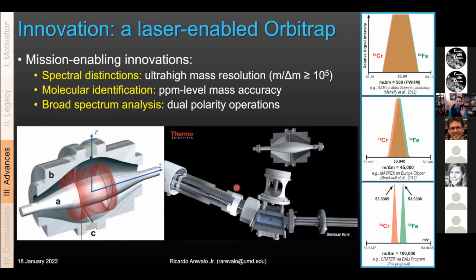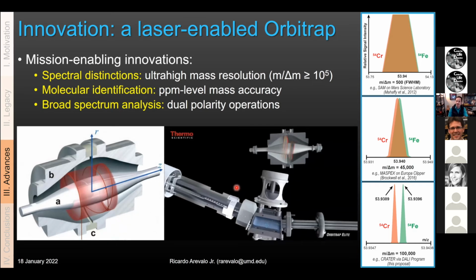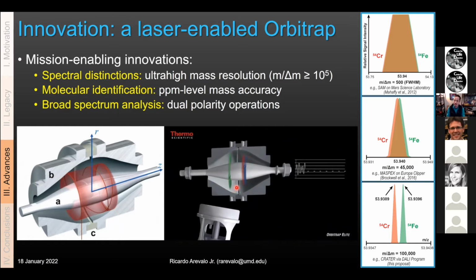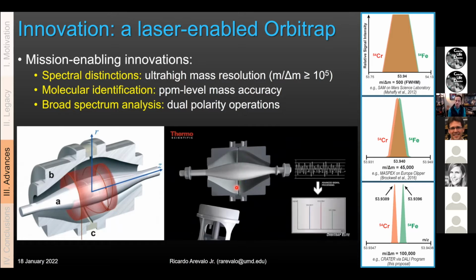I don't have a ton of money to make really awesome graphics about how the instrument works, but Thermo does. This is a cool graphic, it's an Orbitrap Elite, so you can steal this from YouTube. It's publicly available, but it kind of shows how the instrument works.